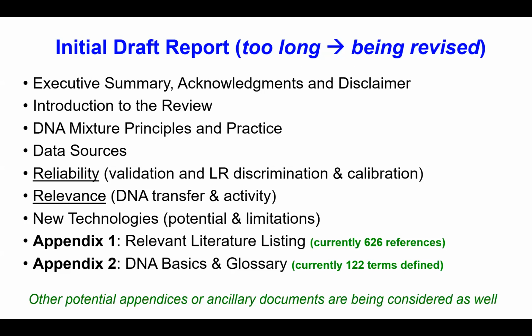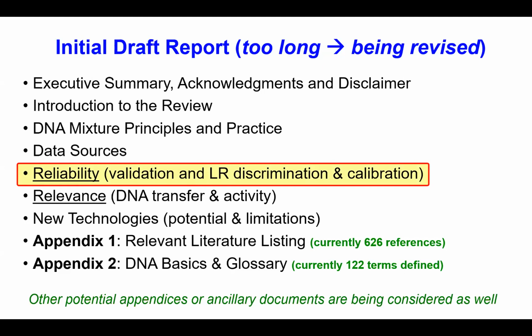Now, what we're going to focus on today really is the reliability aspect. And so Hari is going to get into what we've been thinking about in terms of the likelihood ratio, discrimination capacity, and calibration issues that relate to validation. So we'll turn it over to Hari.